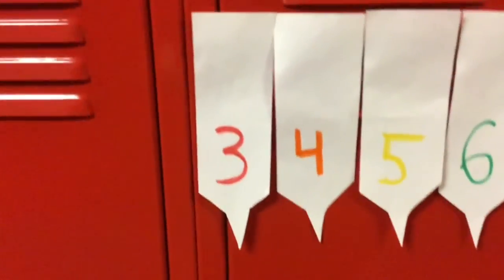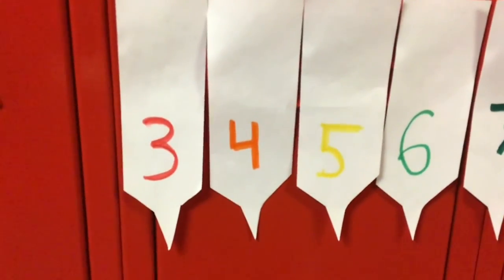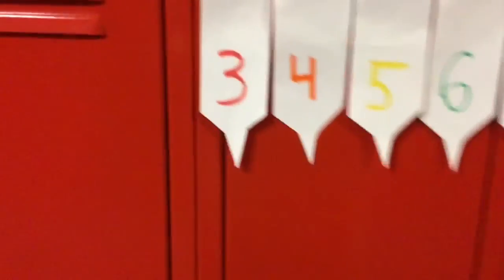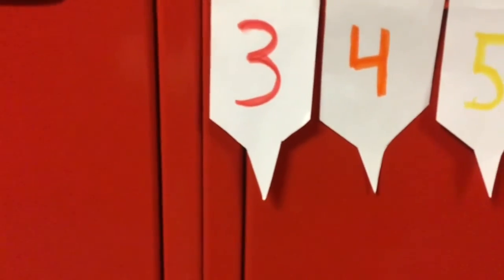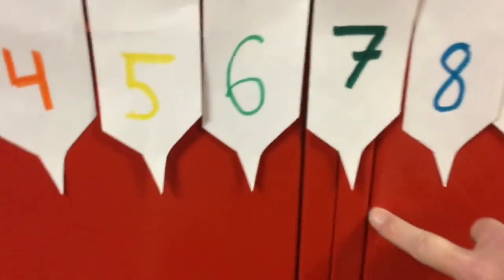Hi guys, all right, so now what we're going to do is try to see if we can figure out why that titration curve made the silly shape that it made. Here's what we expected to have happen. What we had expected was a nice linear relationship between these pH values, meaning that if we were to start at 3 and go to 4, for example, the distance between these two would be about the same as the distance between 4 and 5, 5 and 6, 6 and 7.